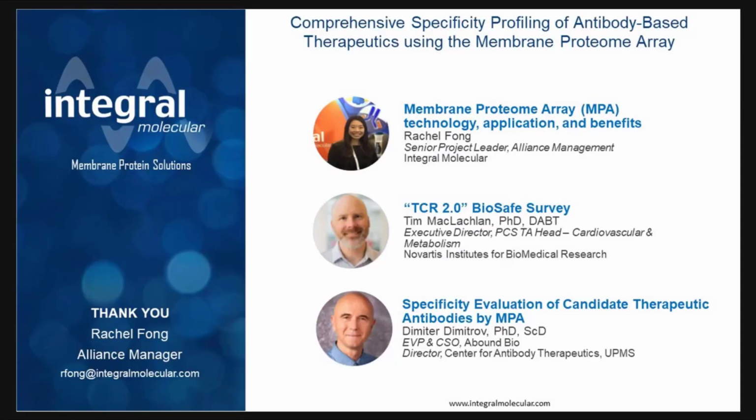Thank you very much to all three of our presenters. We do have some time now for a question and answer period. I have some questions that have already come in. Please feel free to chat your questions to all panelists. Our first question is for Rachel. Can the MPA be used to identify the receptor for my protein of interest?